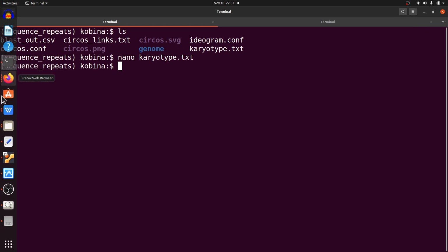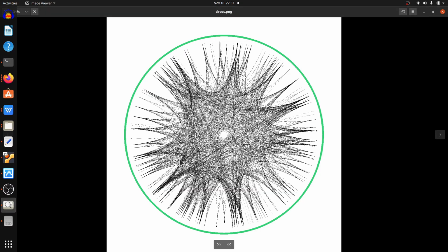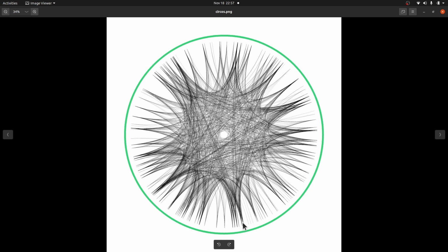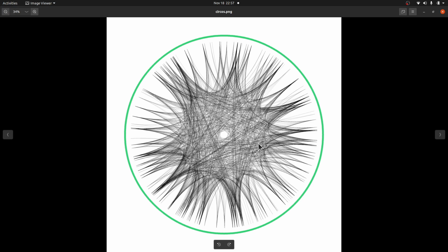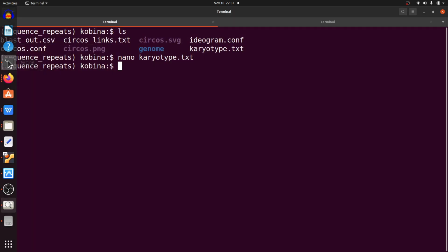Now let's get back to the figure, the plots here. Now what we have here, we can add additional information. So what I want us to do is to add the GC Skew to it. I earlier on even showed that in the image that I showed for the presentation. So we are going to add the GC Skew to it so that we can get some additional information. So that's what we are going to do. So let's get back here and do it.